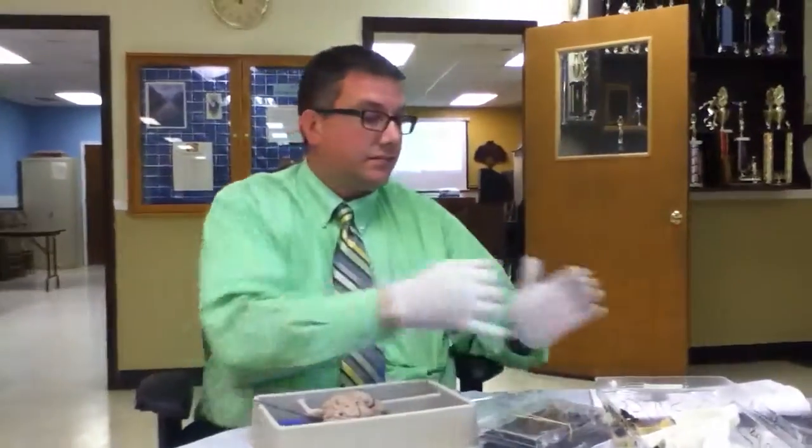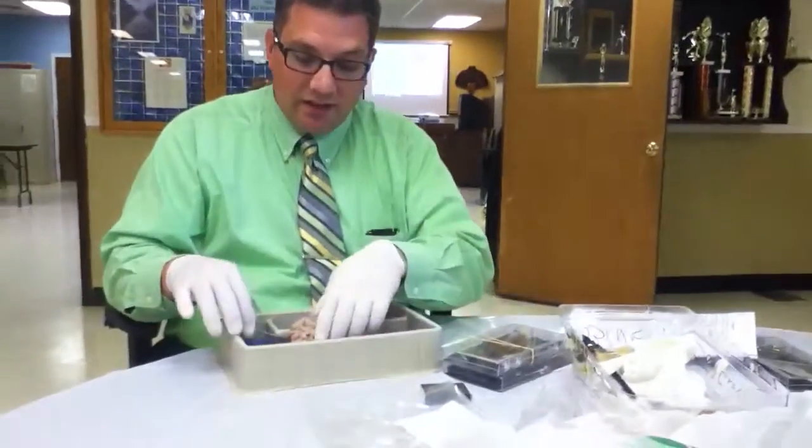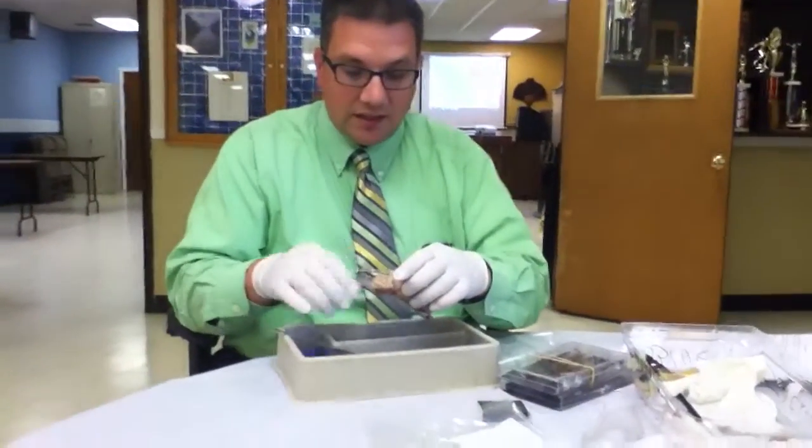Dura mater? Come on, that's how you knew everything. And the middle layer is the... Subduramater? No, it's... Arachnoid? I honestly do not know this. It's the middle layer, and then the pia mater is the innermost layer inside of this.